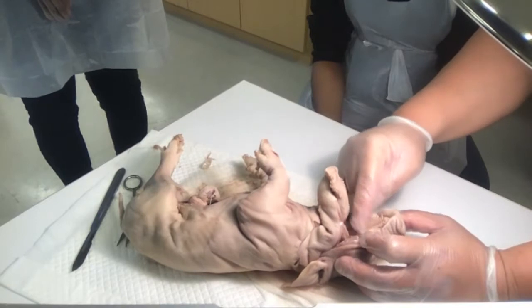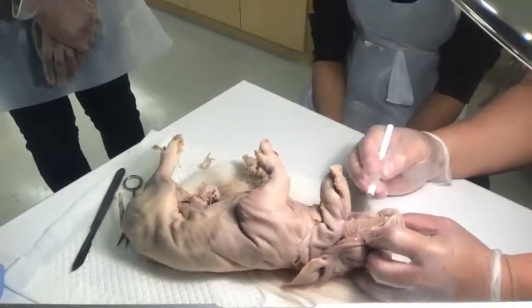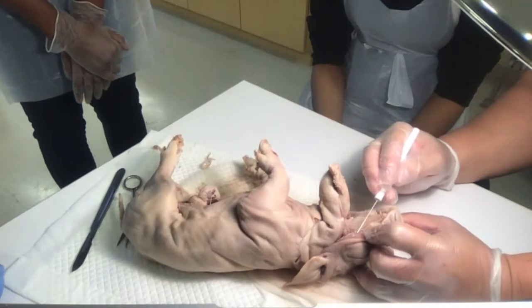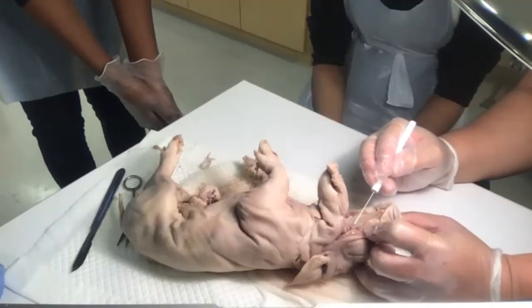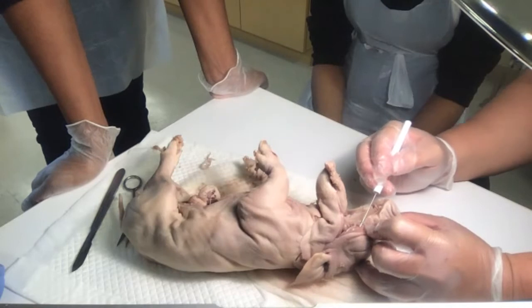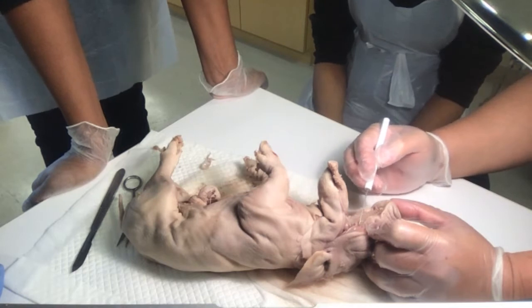Everyone look at this thing right here. Where is me probe? Thank you. See this little button here? See, it's covered in fascia. Let me open it up a little bit. It's hard to tell, but you see this little button here and then this material here that kind of looks like a sponge. Everyone see that? Well, that is a gland. And that's one of the salivary glands.